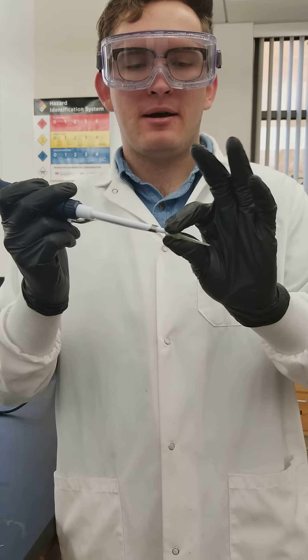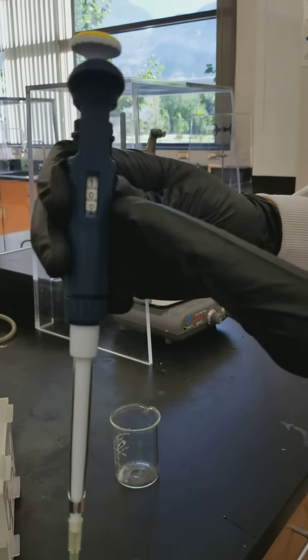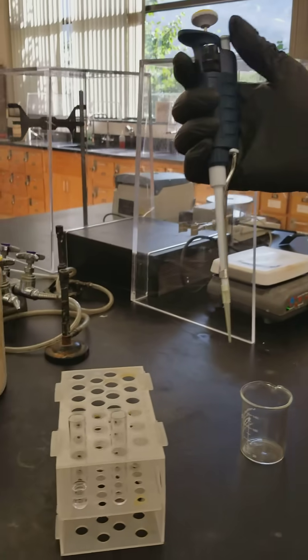First, firmly attach your micropipettor tip to your micropipettor so it doesn't fall off. Then you need to make sure your volume adjustment is correct. Right now I have it set to 100 microliters, which is perfect for us.